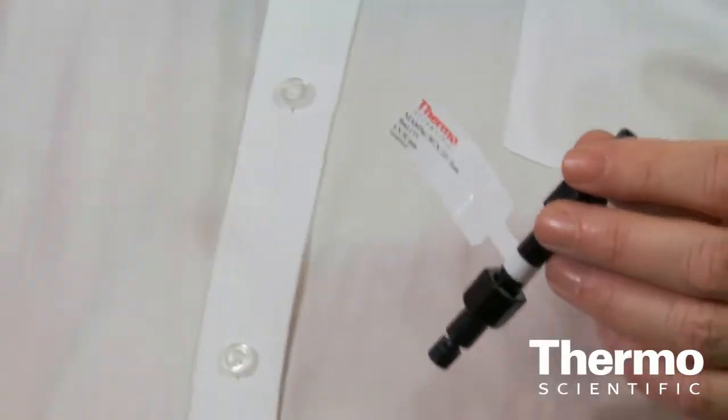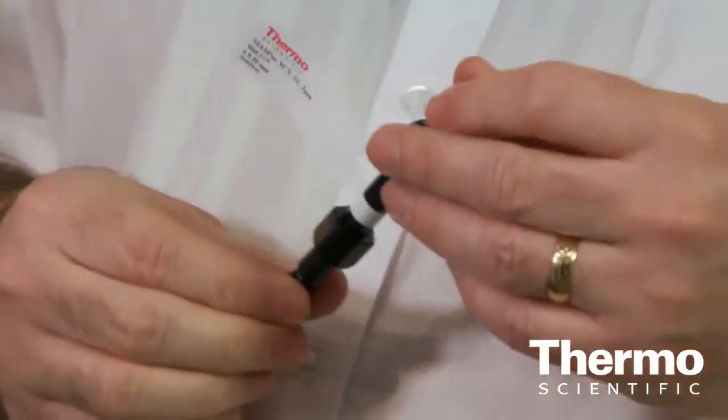The small particle size that these columns now have offers a much faster separation time. These columns are based on an absolutely unique stationary phase design. They have a solid polymer bead which has a hydrophilic outer coating, and then a polymer graft that handles the ion exchange element of the separation.